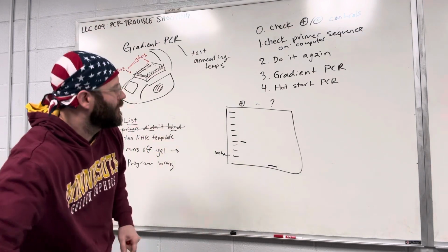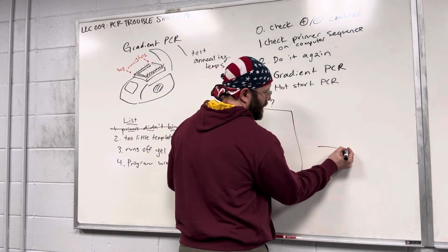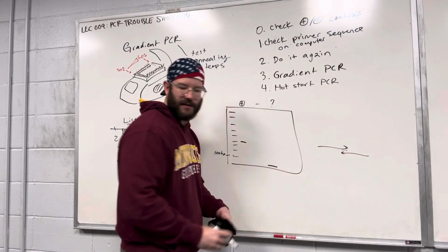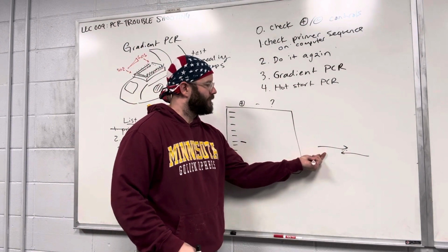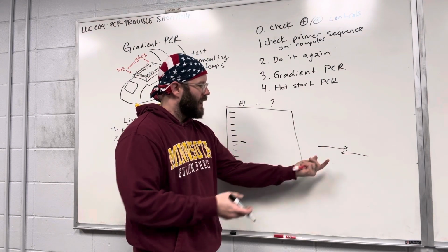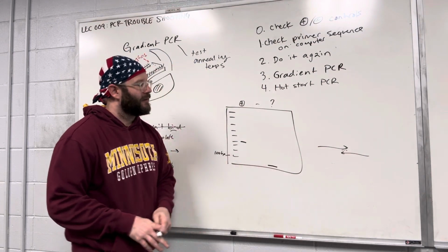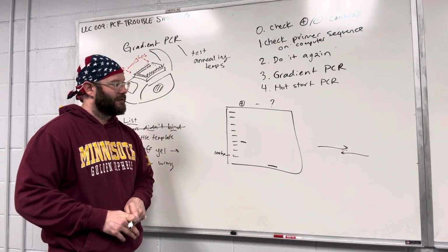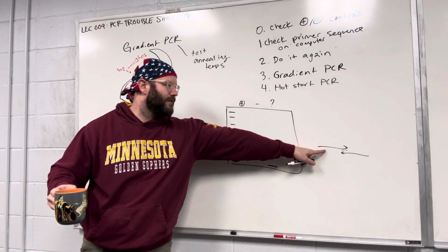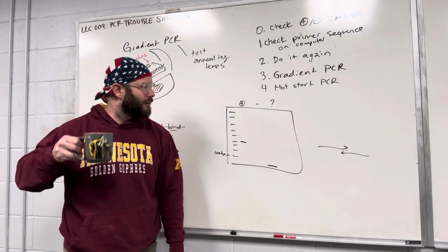So sometimes when you do your PCR reaction, your primers have little sites where by accident they are able to bind to each other, okay? What kind of a problem is this gonna cause when you try to run a PCR? What's gonna happen? In the tube, envision the molecular biology. What will happen if your primers are doing this? Well, the primers will just bind to each other, not to the DNA template.